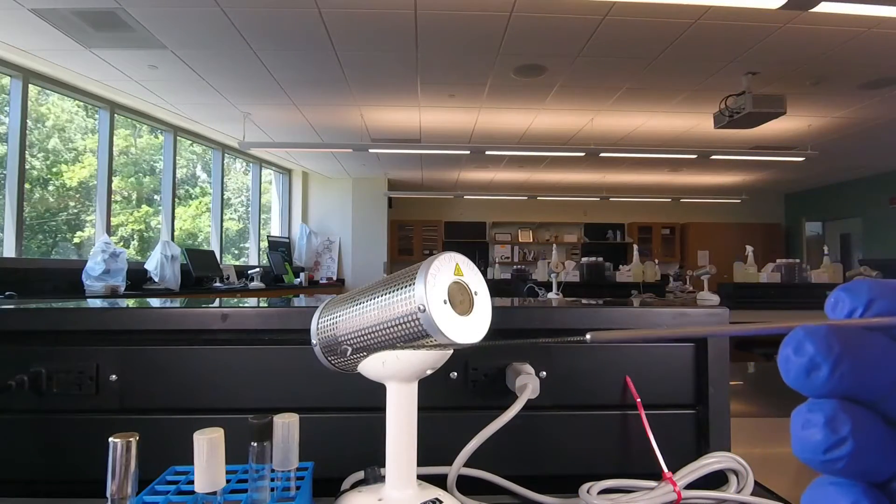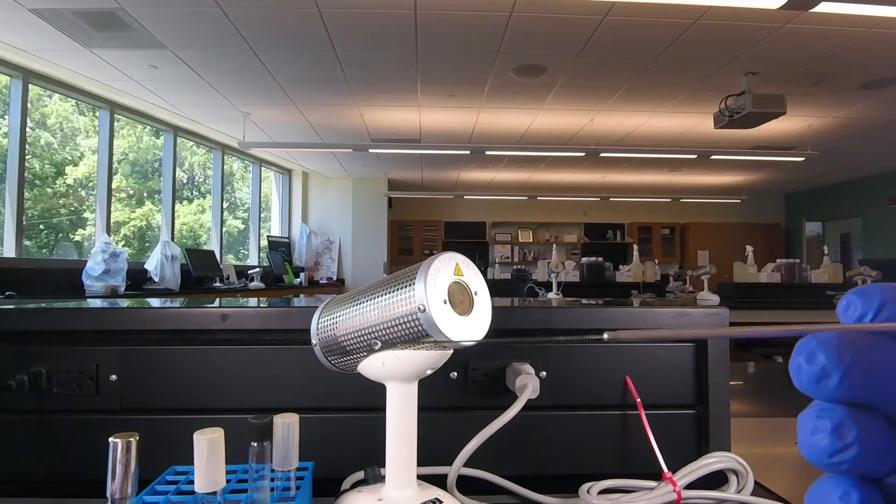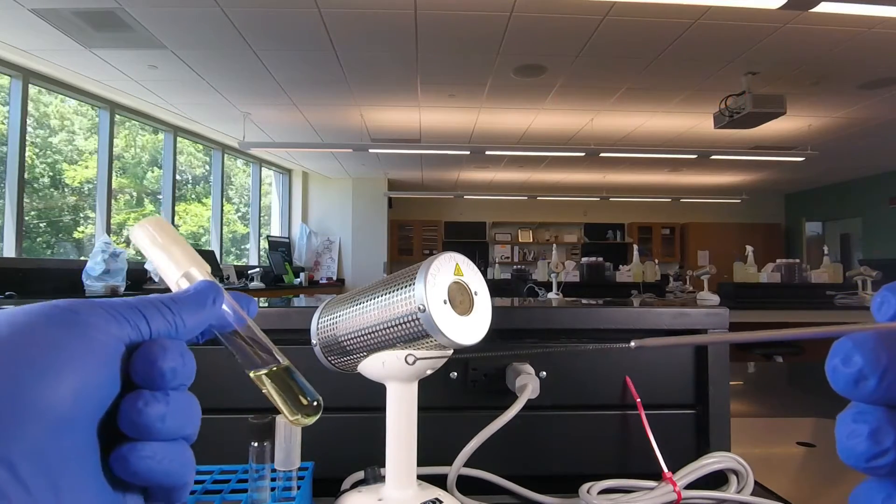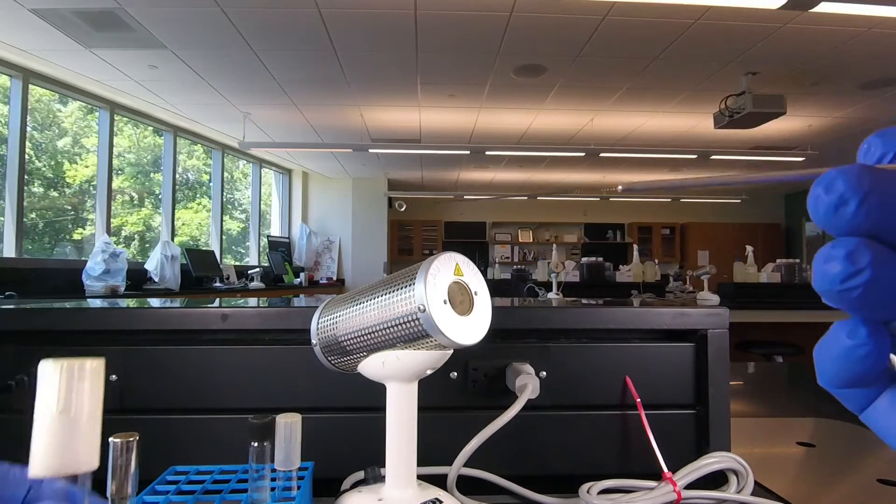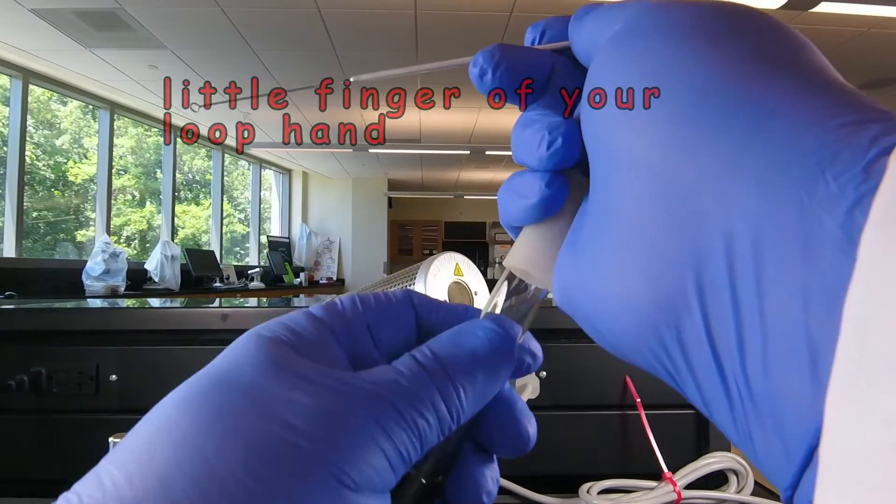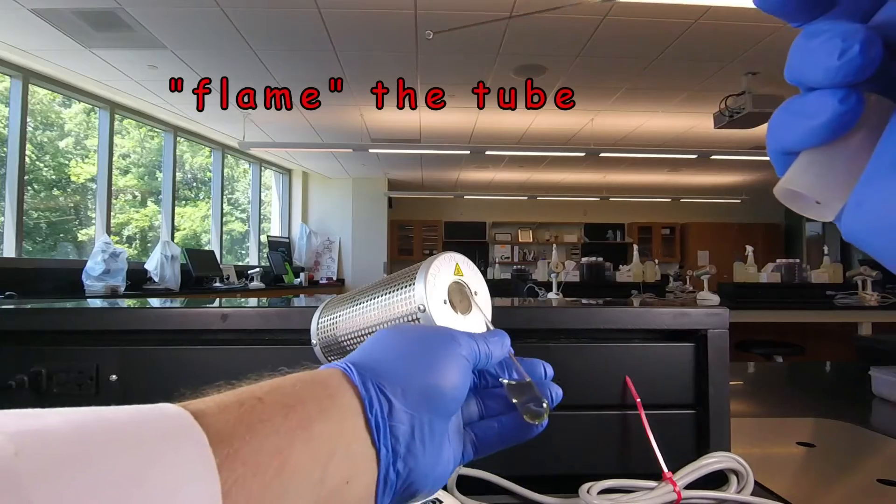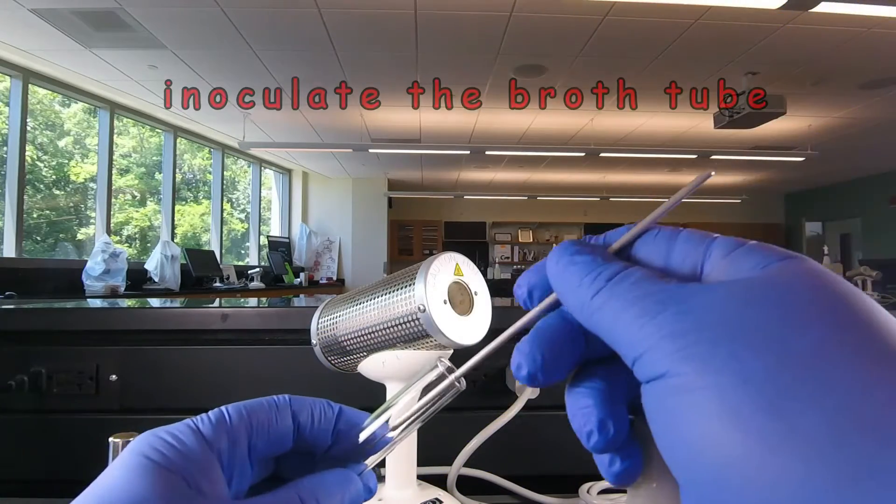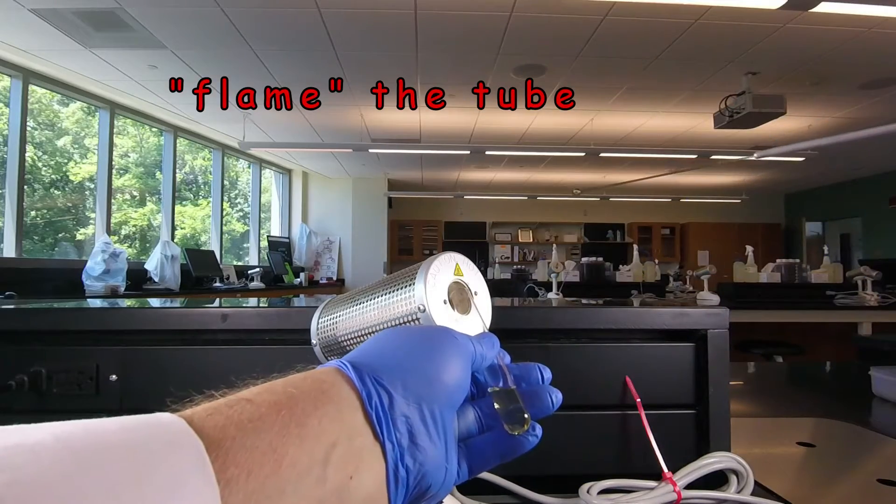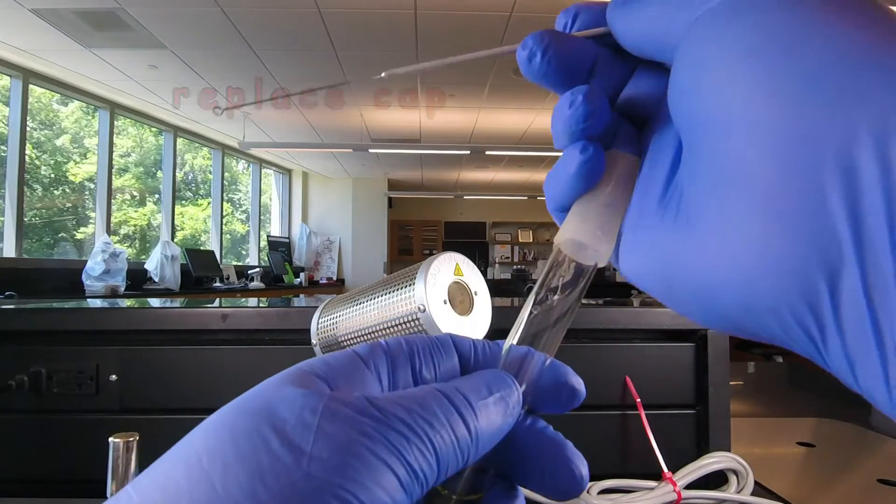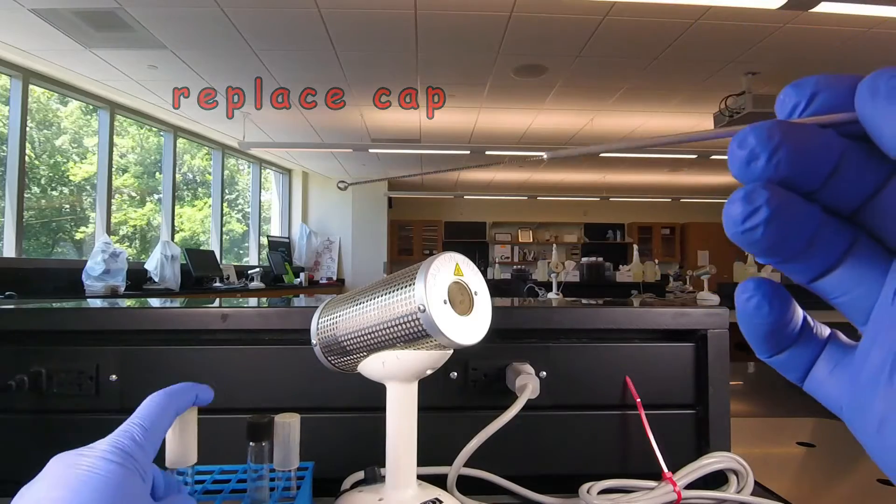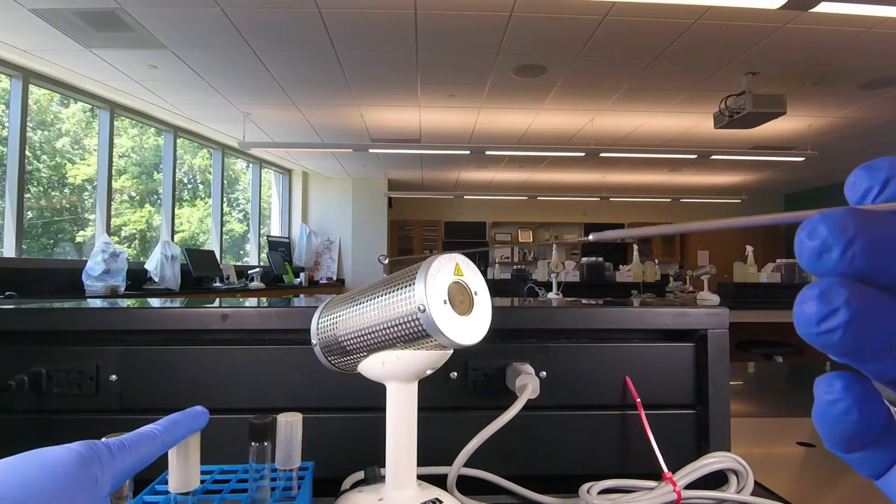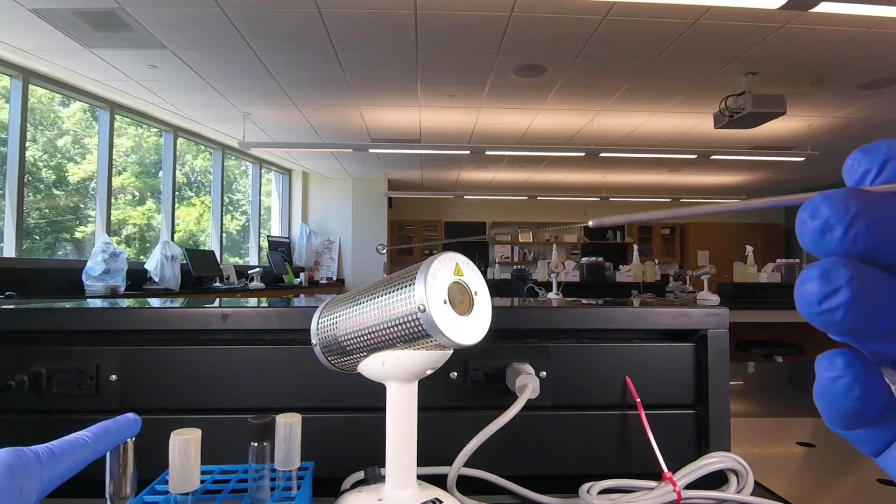And now we have the E. coli on our inoculating loop. Now we're going to grow it in this tube of tryptocase soy broth. So this is our sterile medium that we want to grow our E. coli in. We remove the cap of the sterile medium, flame it for three seconds, put in the E. coli, flame it for three seconds, put the cap back on. And now the only thing growing in this tube should be the E. coli. No outside contaminants, no contaminants got in our pure culture.